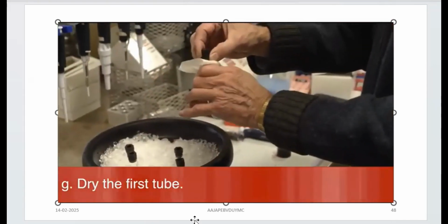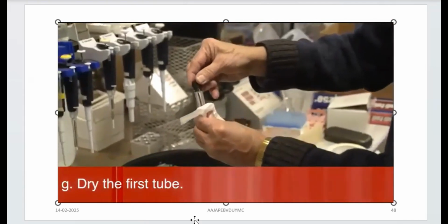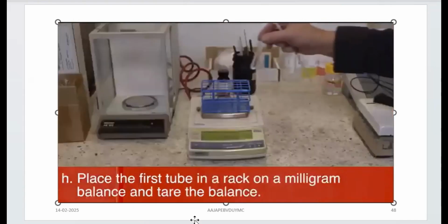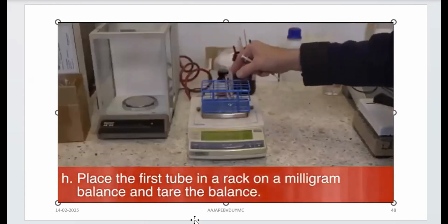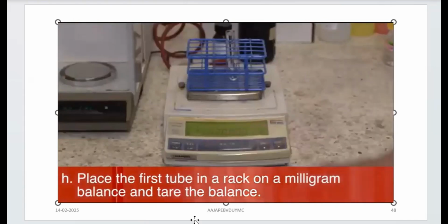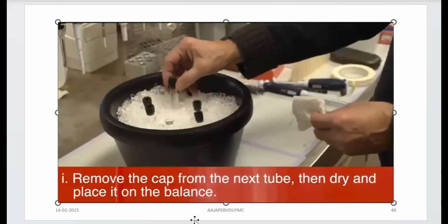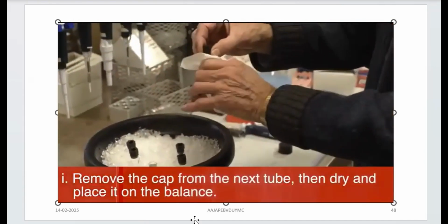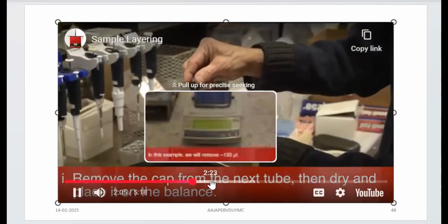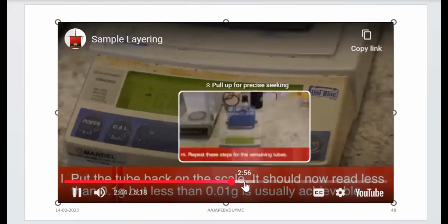It is cut for the easy delivery of the solution. The lid is open, right? They are taking the weight of the tube, right? So for all the tubes, it is like that, right?